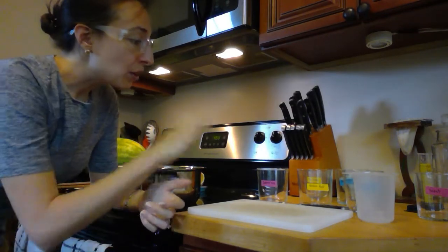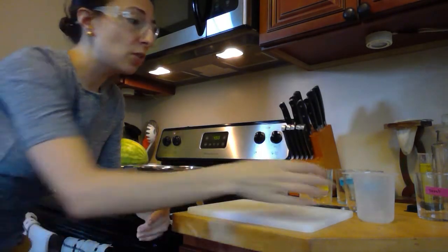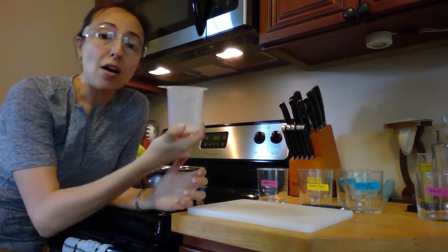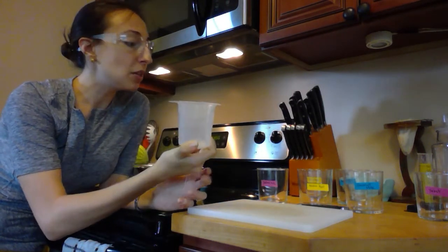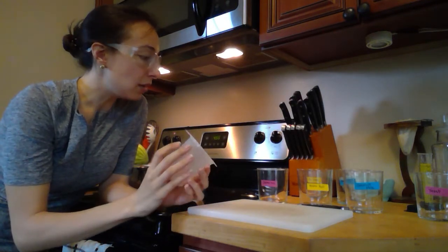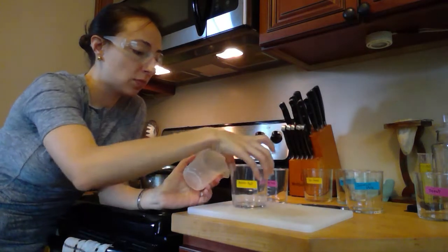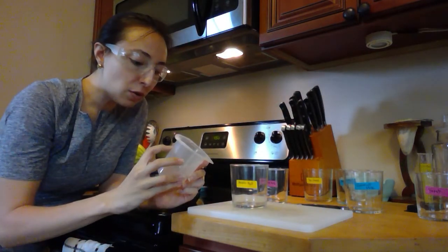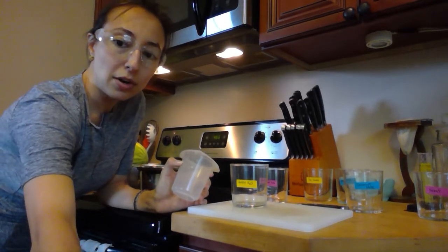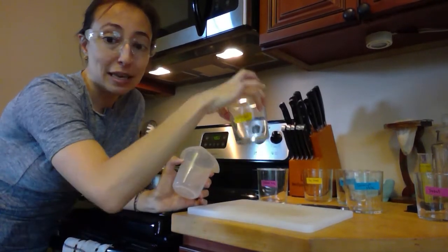All right. I'm going to go ahead and fill up my different cups. And the way I'm going to do that, again, is by getting 200 milliliters of the liquid. So I want 200 milliliters of all the different things that I'm testing. Let's start with my acidic water. So I'm going to pause the video. I'm going to go over to my purifier and fill this up to my 200 milliliter mark and add it to my sample cup.